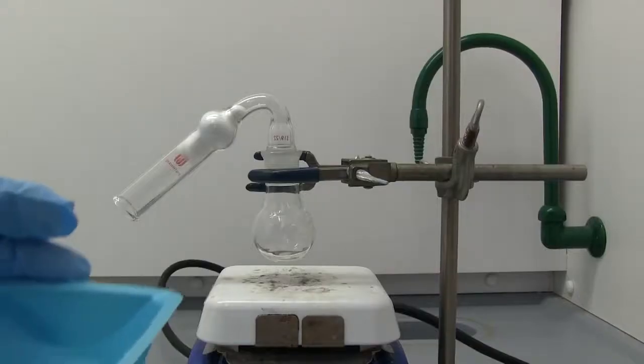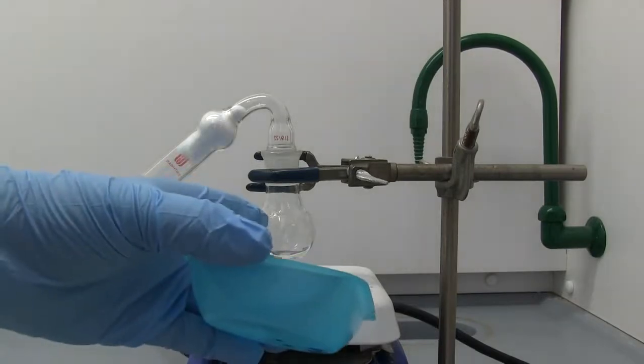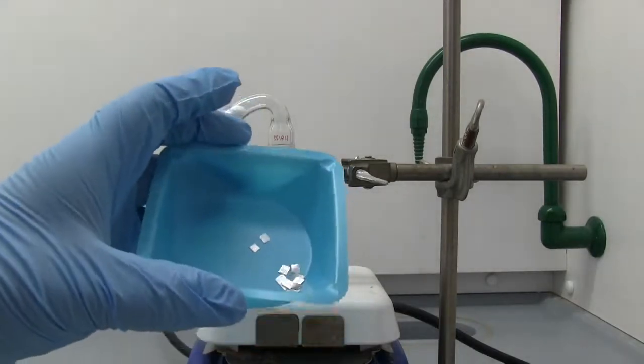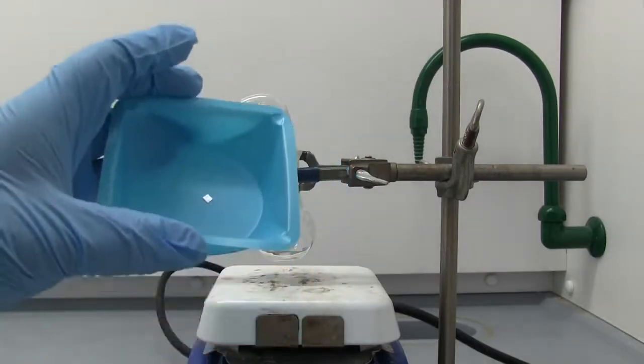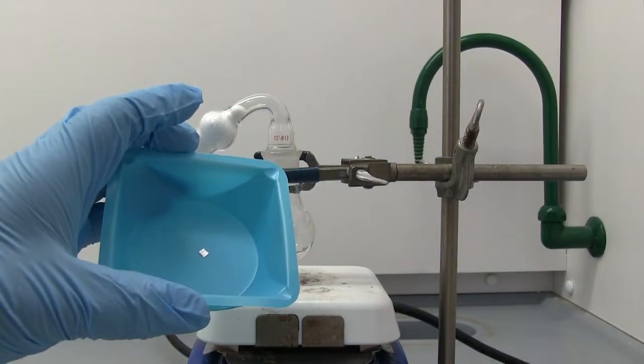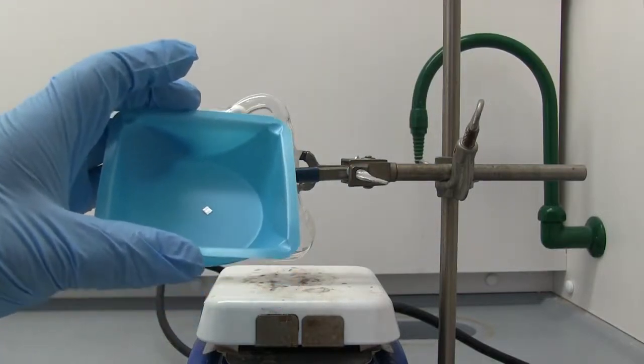All right, so I had to restart the experiment. It's a new flask, same drying tube. I cut up some new and cleaned some new magnesium. This time it was 97 milligrams after being cleaned. But everything else is going to remain the same. And I'll join you when we get the methyl iodide in.